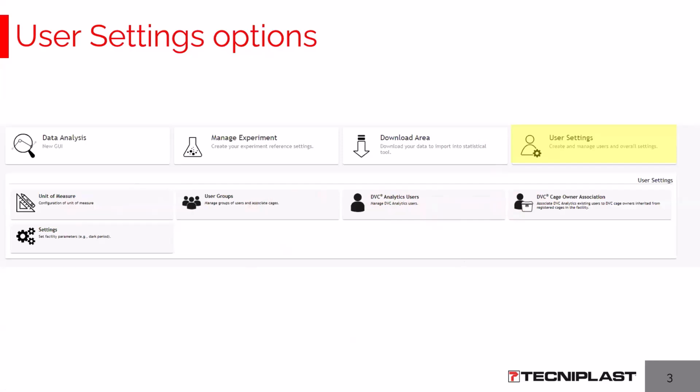Intuitively, if you are a manager, you can invite as many users as you want. If you have been invited as a researcher, you can only access the cages and you can only perform an analysis without inviting any other user. I hope this slight but very, very important difference is clear now between the two roles.